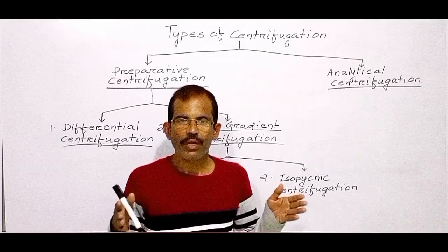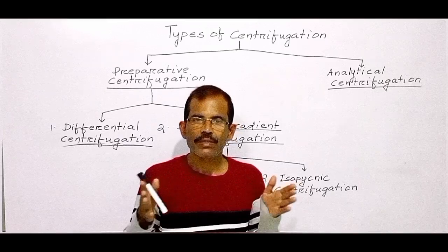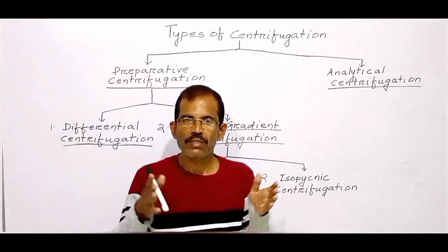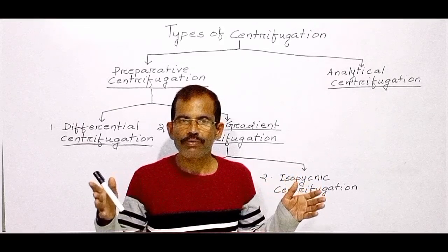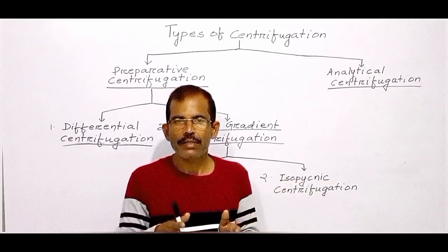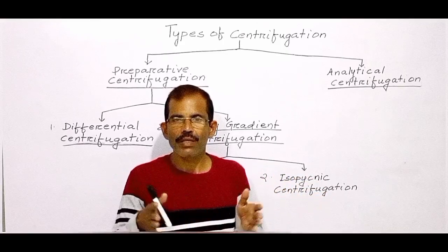Now the question is, what is buoyant density? Buoyant density is the apparent density of an object when it is submerged within a fluid, taking into account the buoyant force acting on it. It is a measure of how tightly packed the mass of an object is within a fluid influenced by the buoyant force.